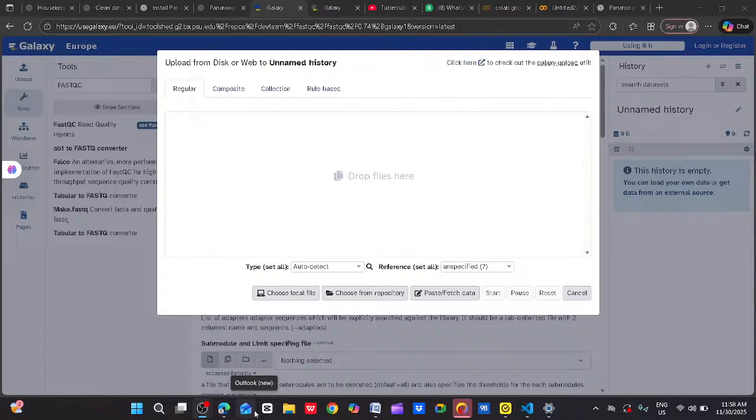That is trying to design a multi-epitope vaccine against the immunogenic genes of multi-drug resistant Mycobacterium tuberculosis isolates from five southwestern states in Nigeria. Okay, so we move from the field down to the laboratory, then down again into the dry lab, which has to do with the computational analysis of it.